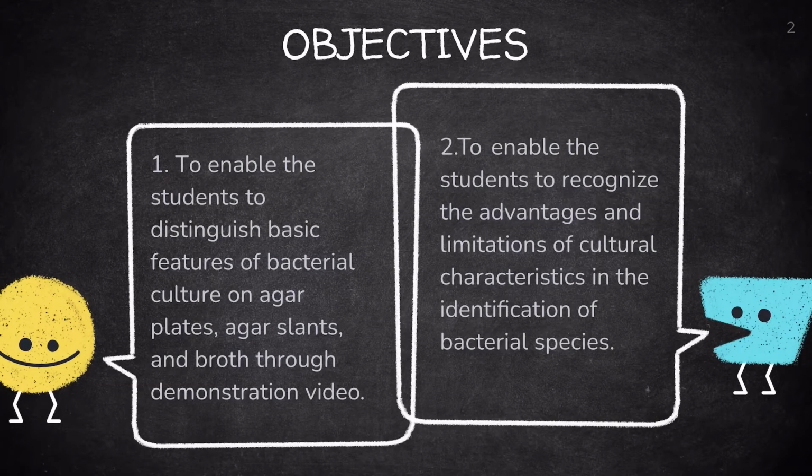For the objectives, we have first, to enable the students to distinguish basic features of bacterial culture on agar plates, agar slants, and broth through the demonstration video. Second, to enable the students to recognize the advantages and limitations of cultural characteristics in the identification of bacterial species.